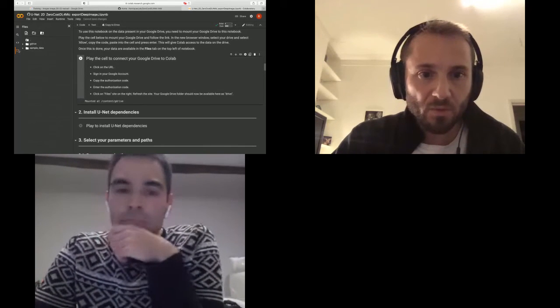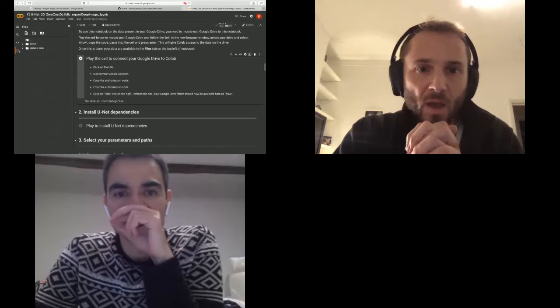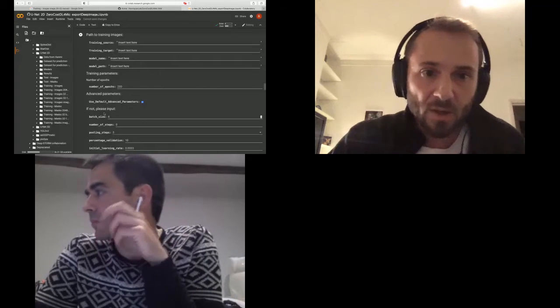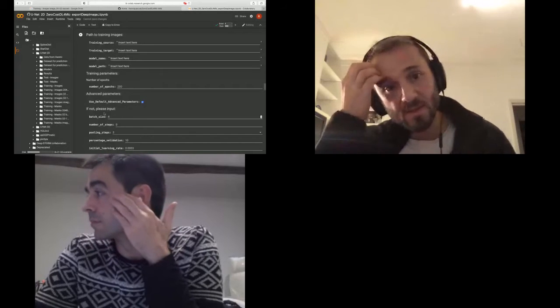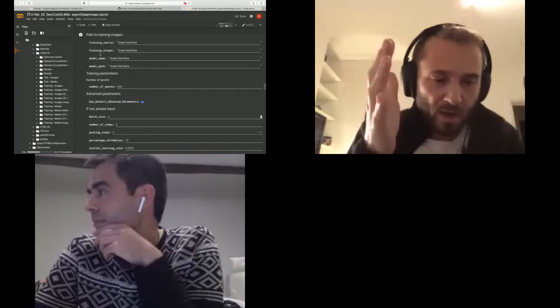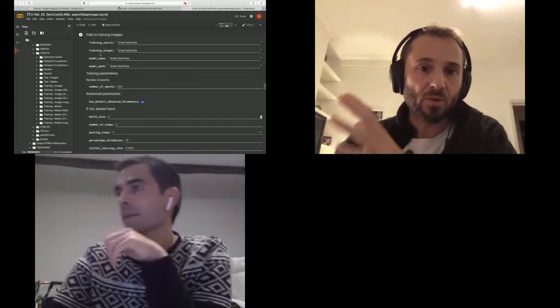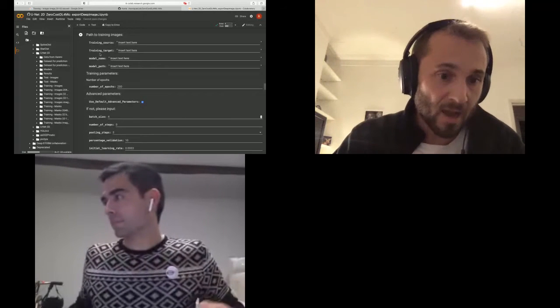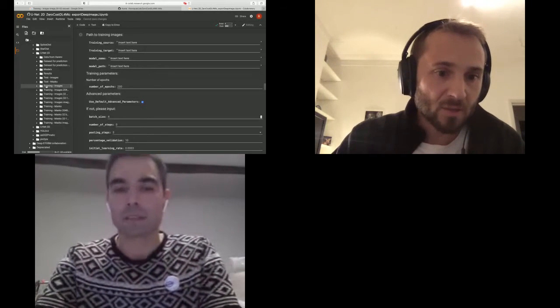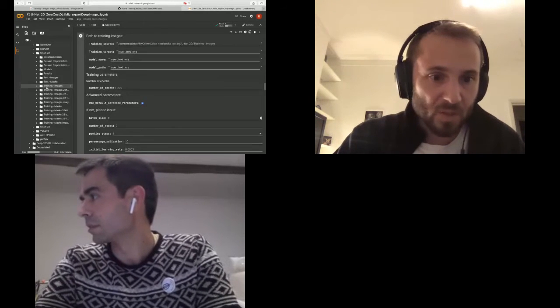We're going to set up a couple of parameters for training this network. The first thing is to give it the source images, the initial electron microscopy images, and the ground truth masks that are paired with those. I've got two folders right here with the data in them. Let me show you quickly.